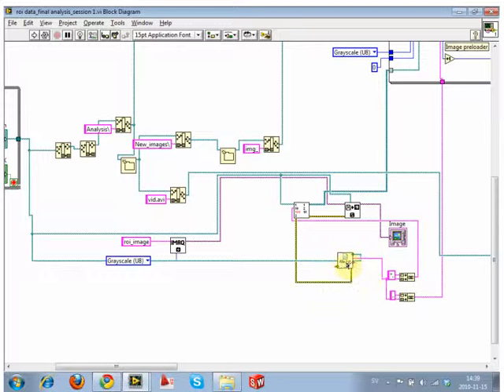And if it's telling us what's after the dot, then if we put star dot in front of that, it means everything, all the text files, star dot txt. If this was a JPEG file and it had file.jpg, then this would be star.jpg. And then our sort filtering thingy requires any kind of filter. You write what your filter is. Normally you'd choose star.jpg or star.tiff, etc.